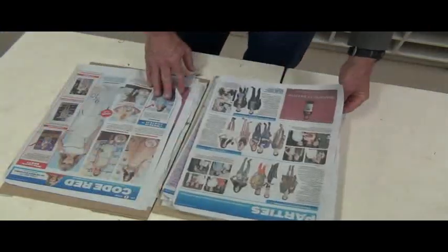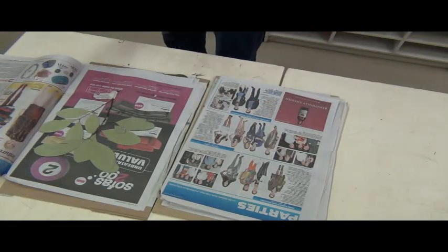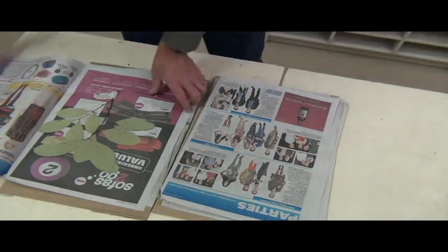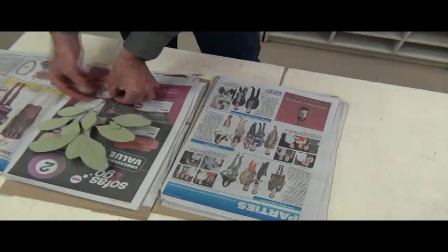Did you say it was best to do it after a couple of hours or straight away? No, no — something like that you can do straight away, but after a couple of hours you can inspect to see that you haven't folded edges and that the placement is all good. Still fold it back? Yeah, you can do that at the time. Same with this — I would have folded those back.